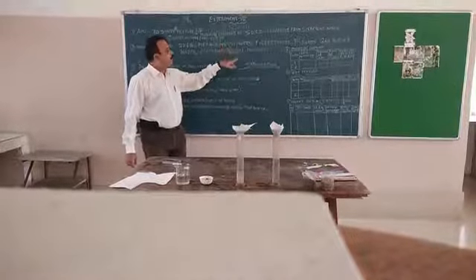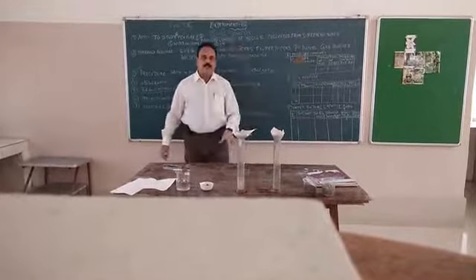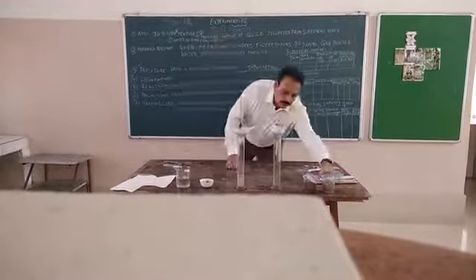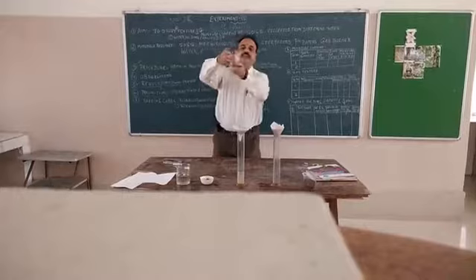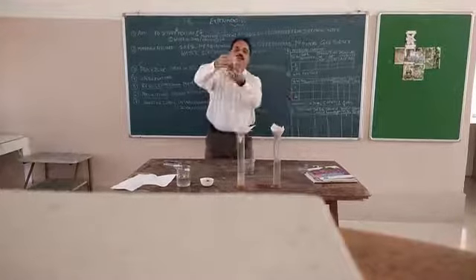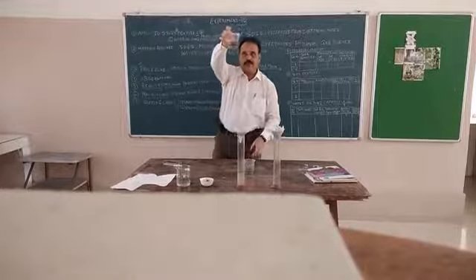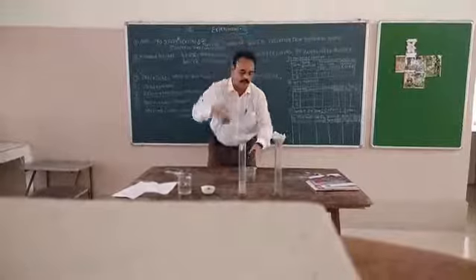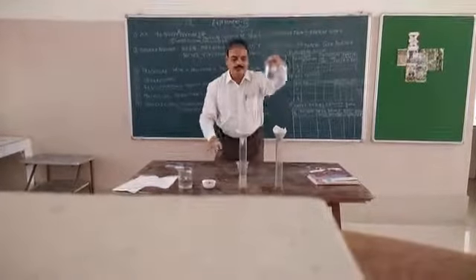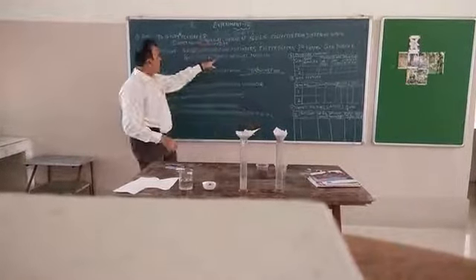For that we have collected 2 soils from 2 different sites. One is, as you are seeing, the rough one, a sandy soil, and another one we have collected from the science school agriculture farm, a smooth soil. Of course, I told you that you can collect it from your own soil. This is available anywhere, so you can collect it and bring it back to the school.